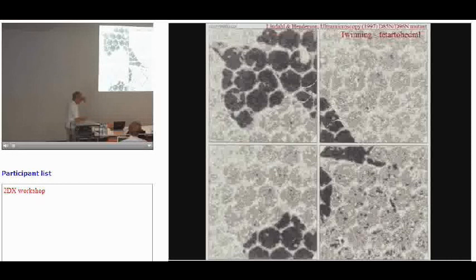So what we did is we used make-tran when we did the 4 different orientations, and we unbent it. And these are the cross correlations from the unbending of the same image with 4 different orientations of the unit cell. And what it shows is that this area is, let's say, the main component. This one is the same as that, but upside down. And these 2 are upside down rotated and the same way around. And you can see they all fit together beautifully into a mosaic because it's a single layer of the crystal.